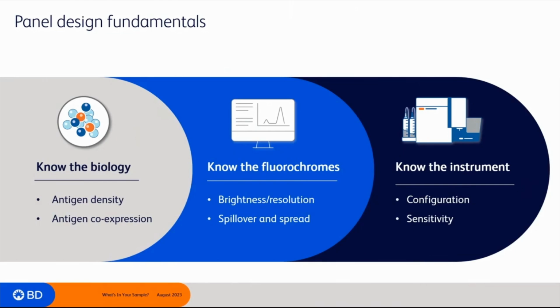The second pillar is know the fluorochrome. It involves fluorochrome properties such as the brightness level and resolution, and how different fluorochromes react with each other in a multicolor panel, and result in spillover and spread. You will learn the tactic to mitigate the spillover and spread in different channels.